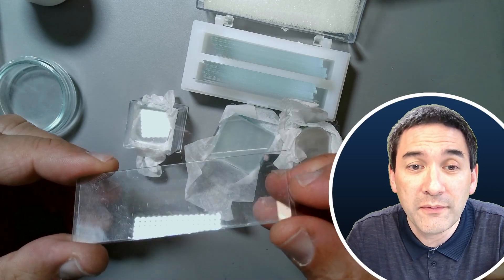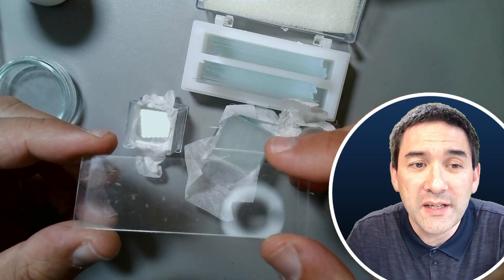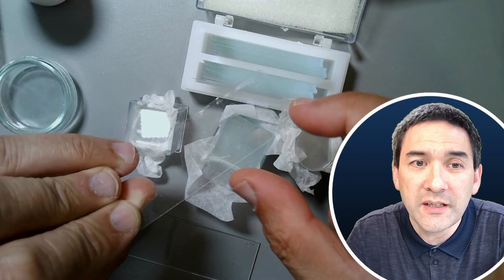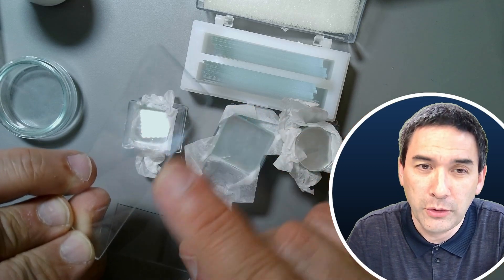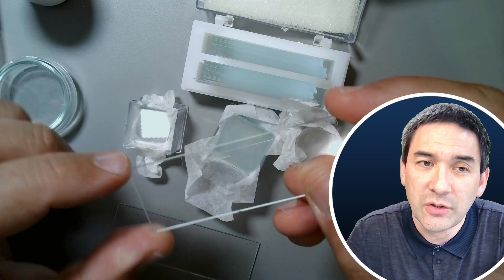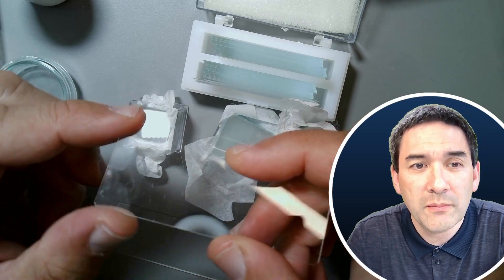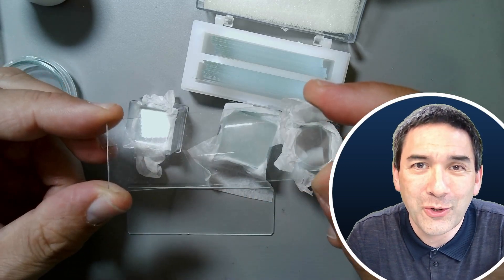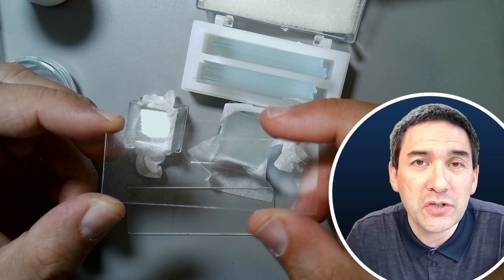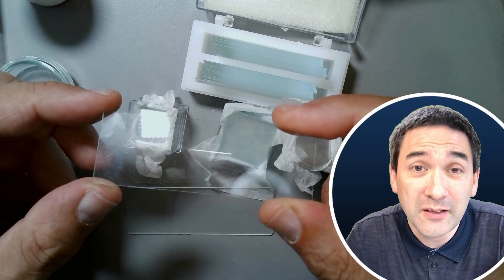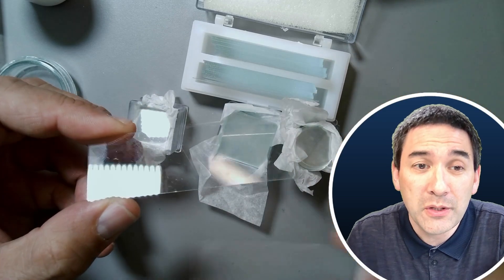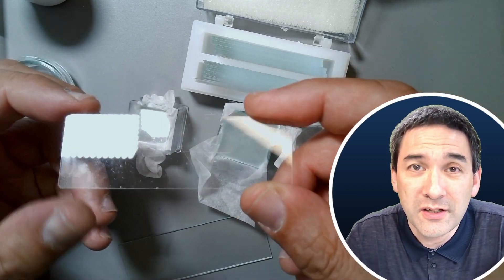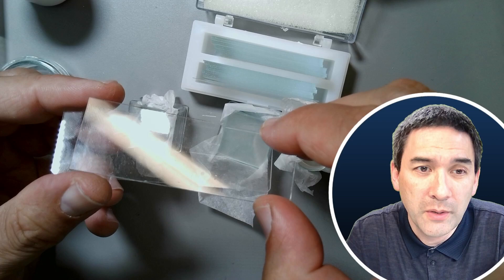These two here have pretty much the same size, but they're a little bit different. This one has an edge that is polished, and the corners are at 45 degrees. These slides are higher quality compared to the other one which has very sharp corners and is cheaper. I prefer to use these because I wash and recycle my microscope slides, so there's less risk of my fingers becoming injured during the washing process. But it's a question of personal preference; both work equally well.